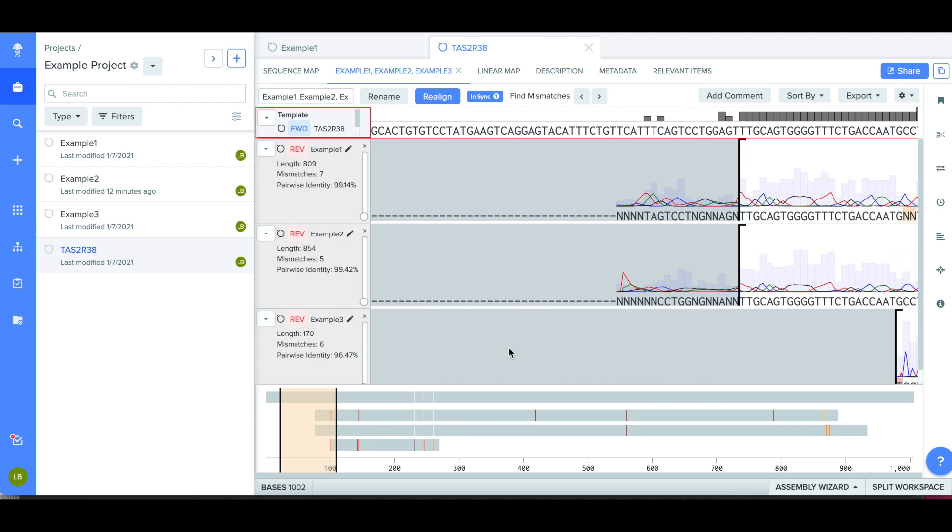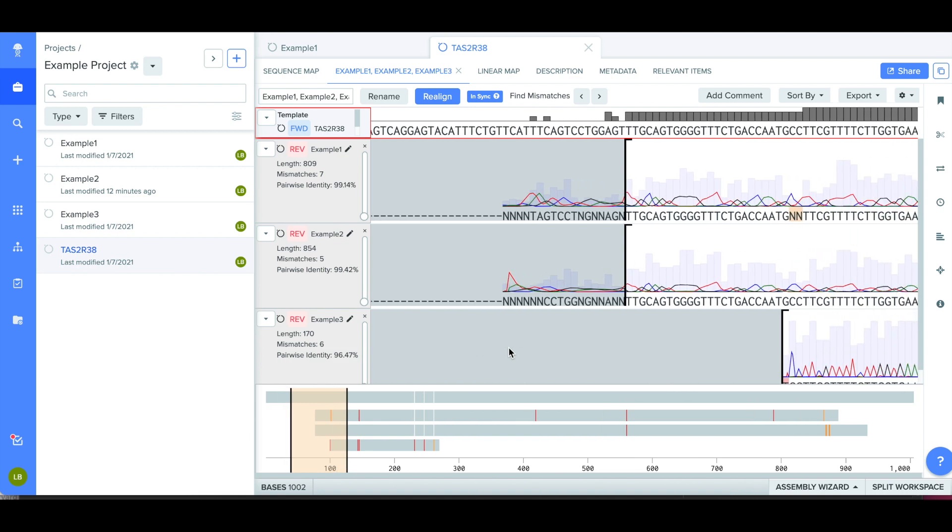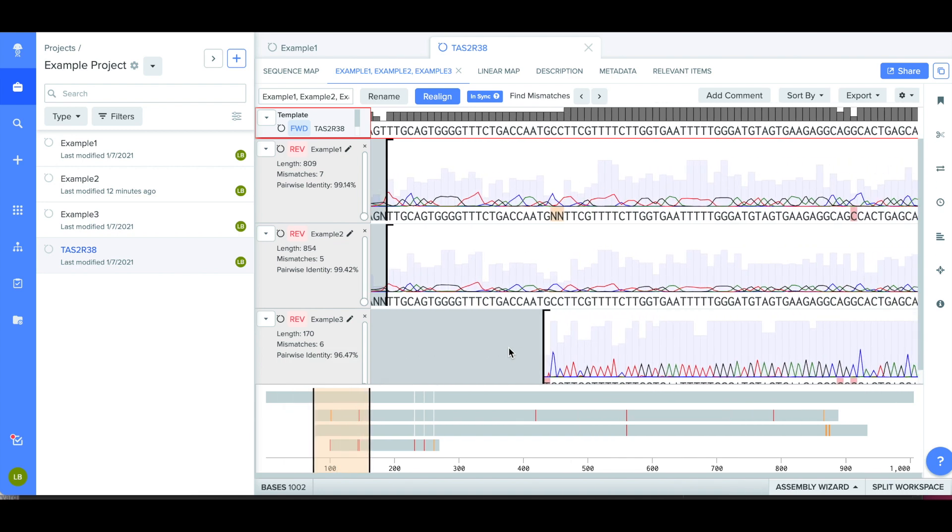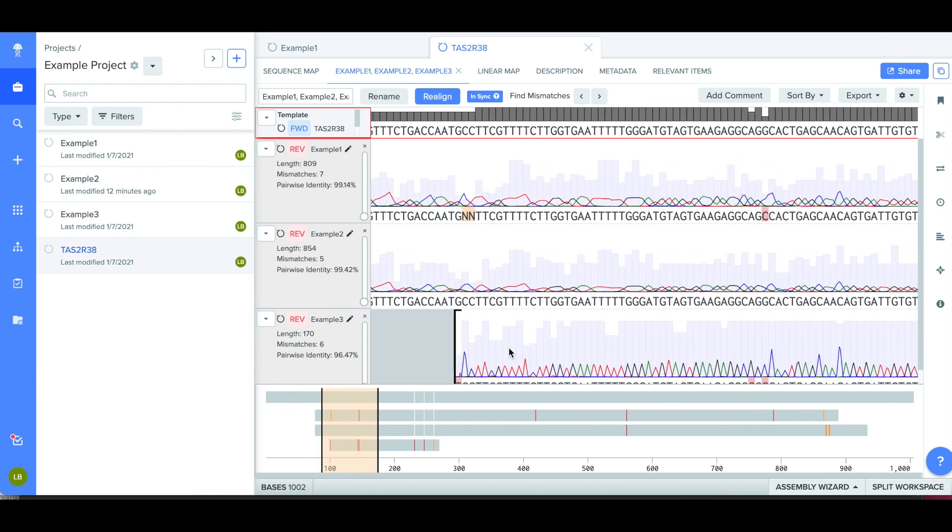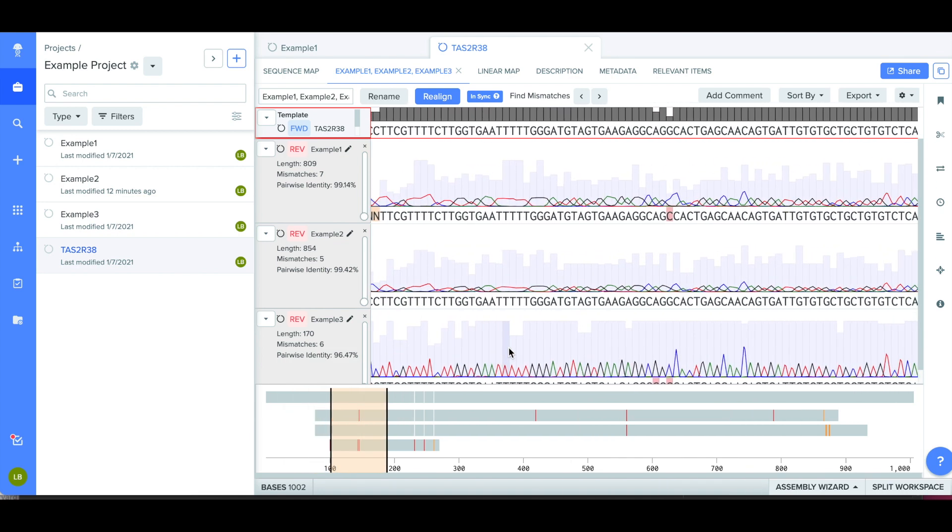I can now see a comparison of all of the sequences compared to the reference sequence at the top of the screen.